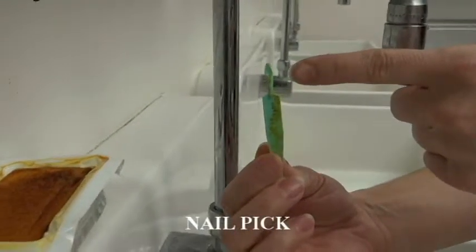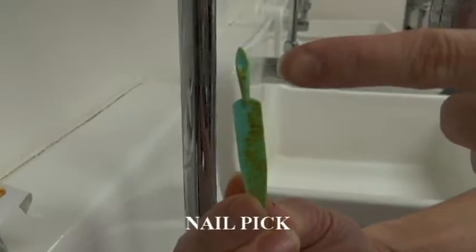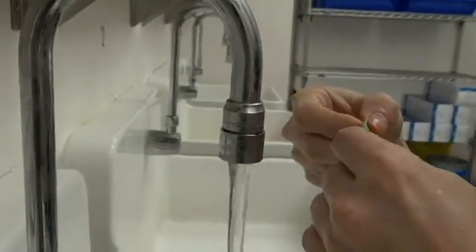Use the pointed tip of the nail pick to clean under the fingernails. You may rinse the pointed tip of the nail pick as needed.